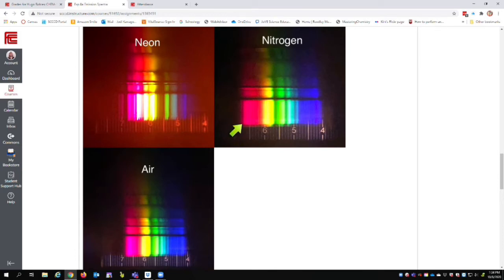And so you might say, well, it looks like it's stopping here and it goes to about there. And so record a range for the red. You might say, well, I think that's about 615 to 680. And record the range. And record a range for the yellow and for the green. For the blue, if you're feeling ambitious, you've got a range here, and then there's a gap, and there's another thing over here. And then you've got the purple down here.